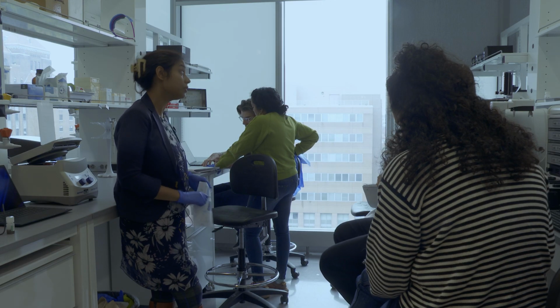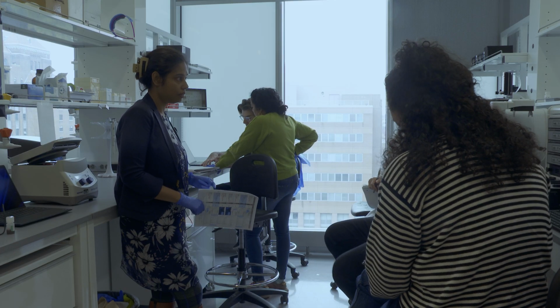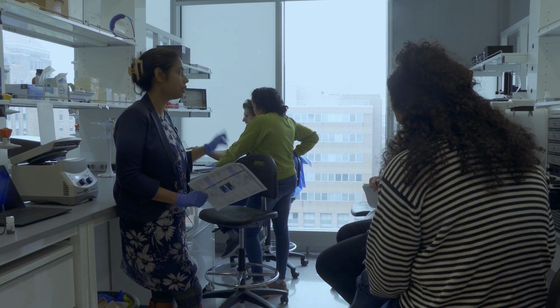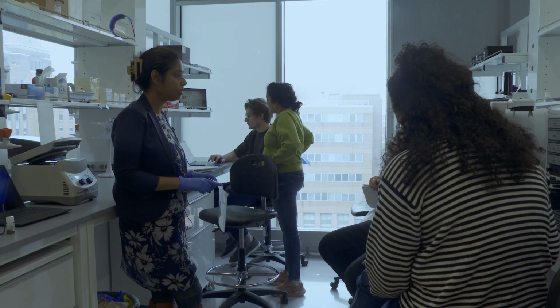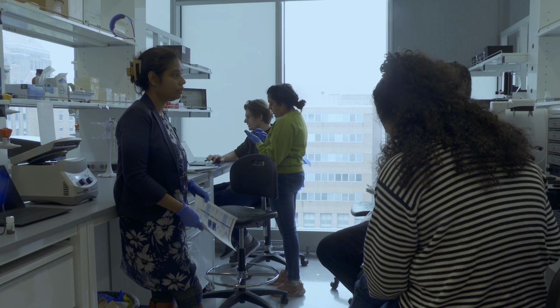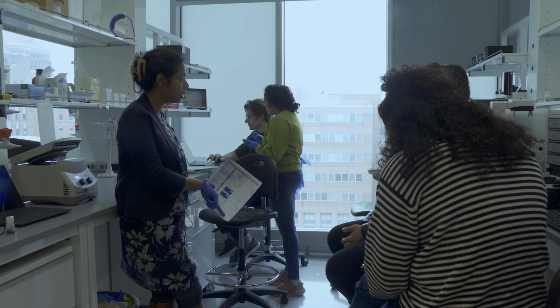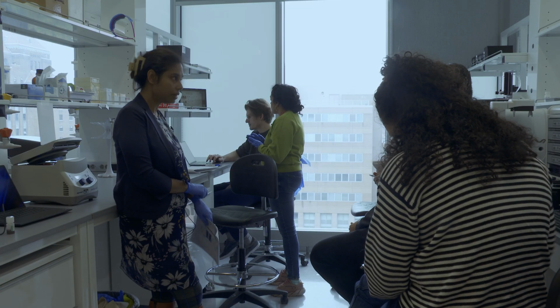This is not possible today because it is a very long day. But if we have time tomorrow, and if we have those AMPure beads in the lab, at least we can try it, and then next week you can run that and see if the data looks better. I think it should look better if we get rid of the contaminant. So I think that would be the way to go. At least we can try that way.